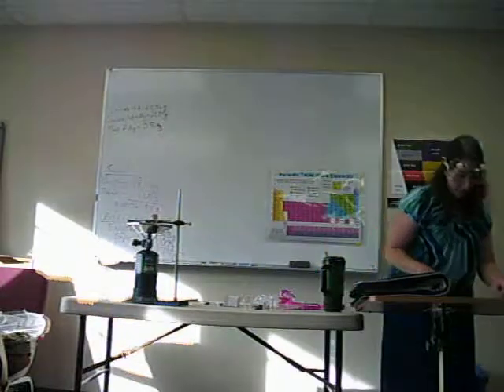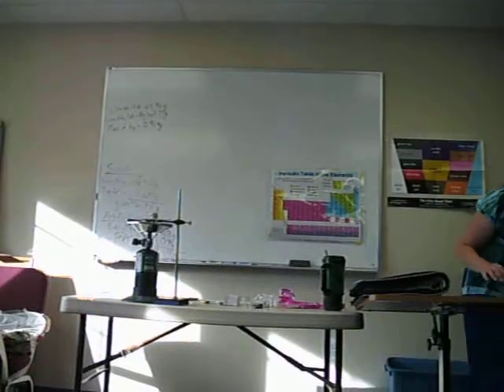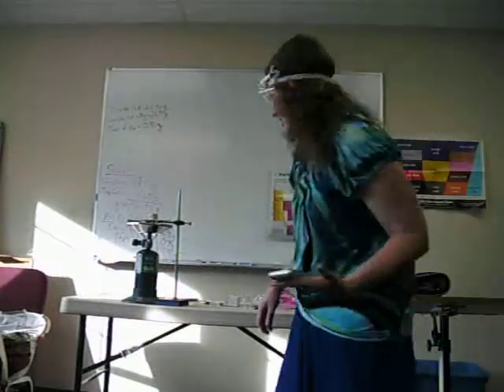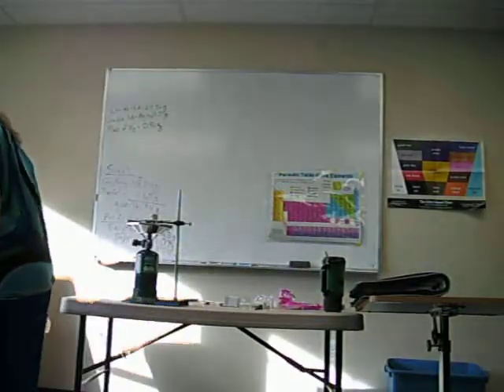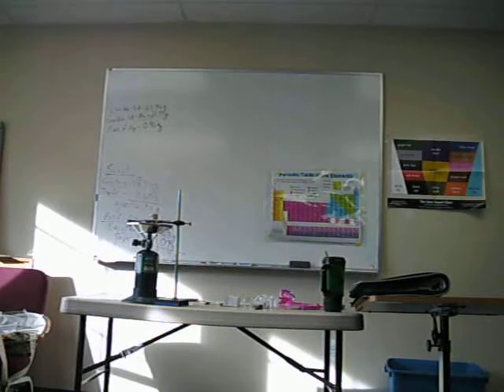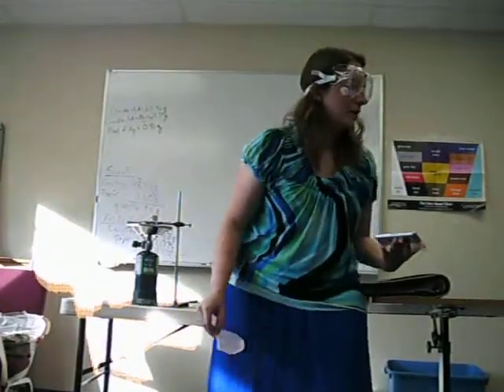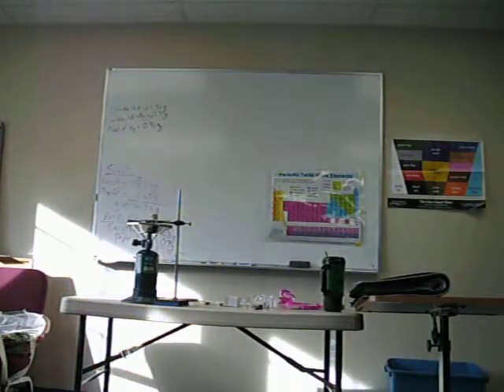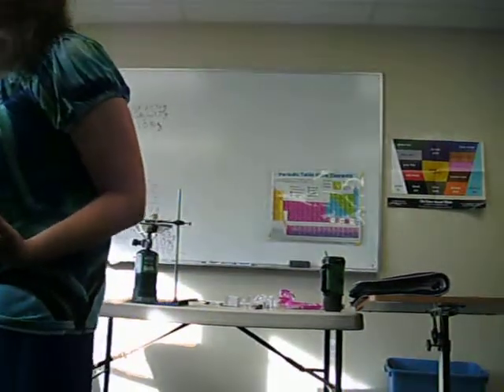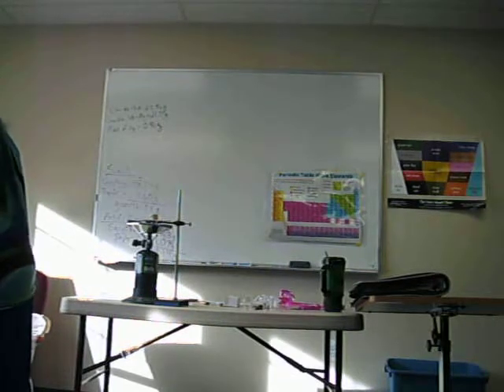All right. So, let's go for the gum mass now. Does your gum feel like it's not sweet anymore? Yeah. Gotten all the sugar out? Good. Everyone with sugar gum, if you have your piece of paper, feel free to spit now. That's what we're going to do right now. We're going to find the mass, hopefully. All right. So spit out gum and space in here.